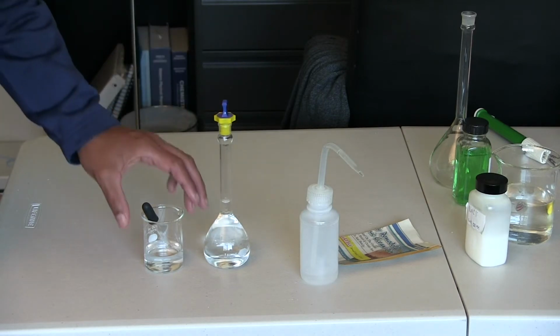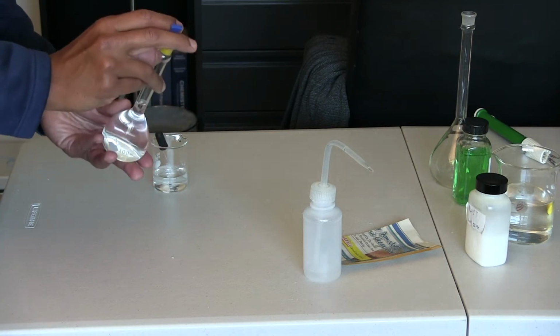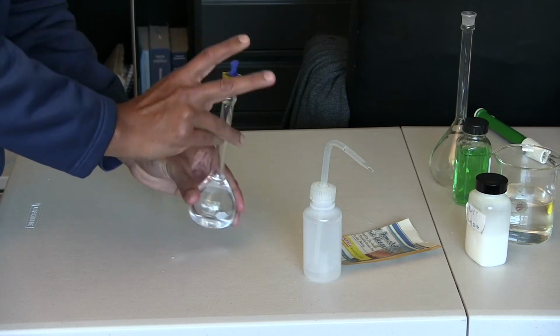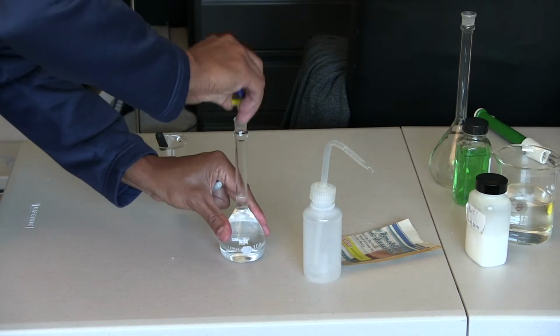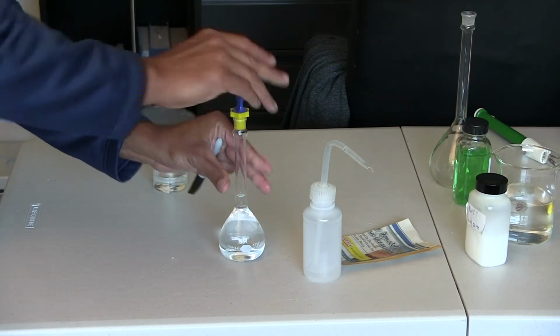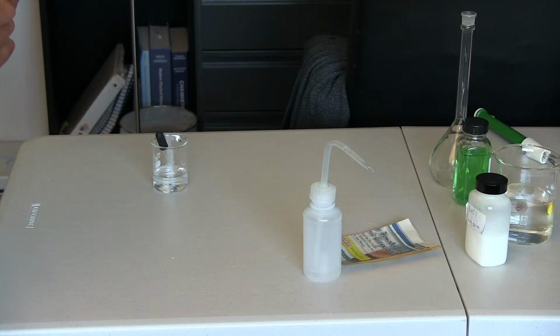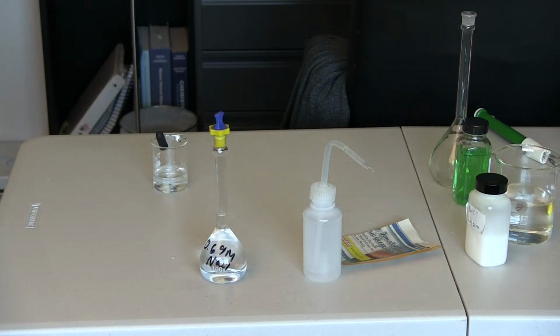So now there's one last thing to do here. Using both hands, I'm going to invert it twice. And here we have a 0.69 molar aqueous sodium chloride solution.